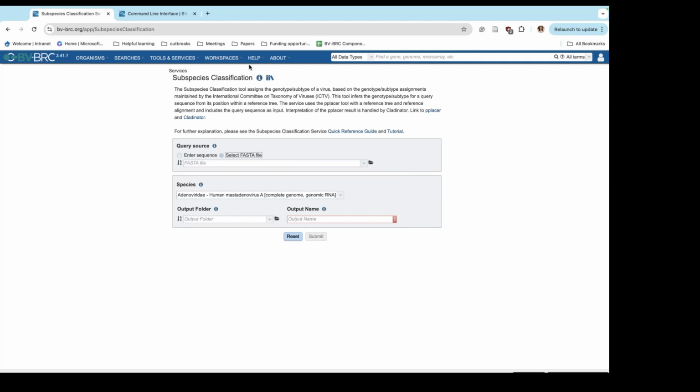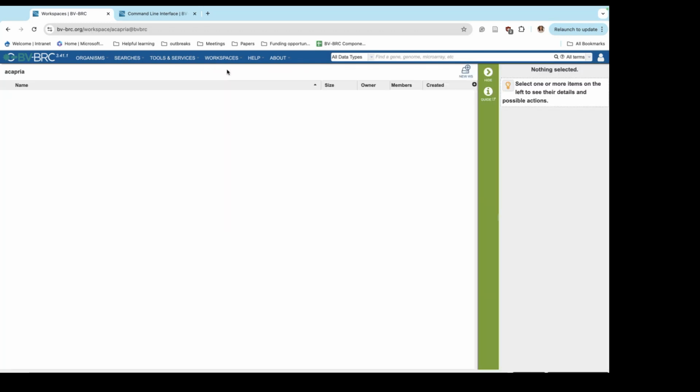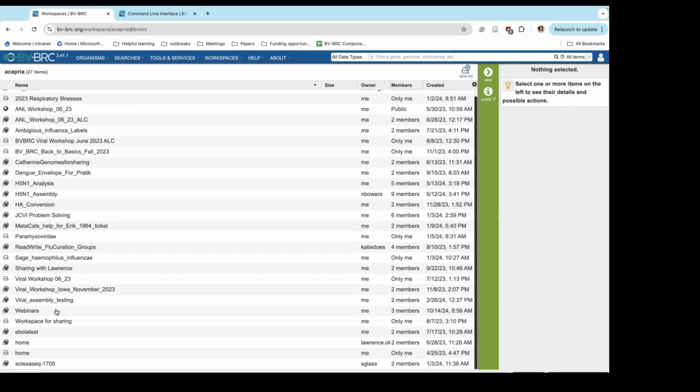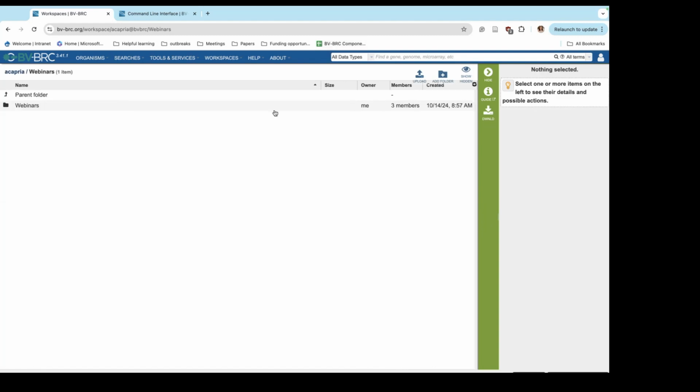That's something I haven't shown on these webinars, so I'll take a second to show you how to upload data into your workspace. So there's a few different ways. The first one is clicking into your workspace. So we'll go to my webinars folder.